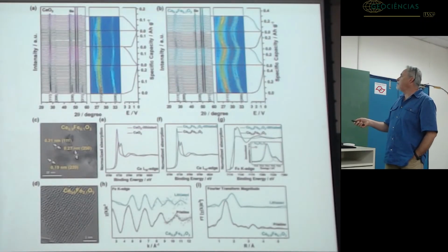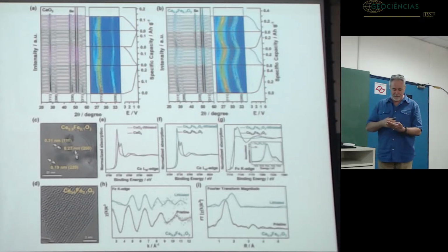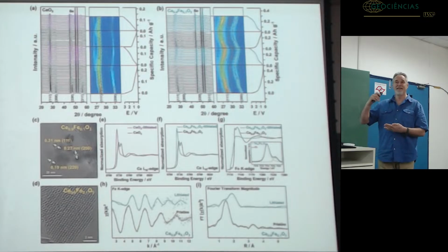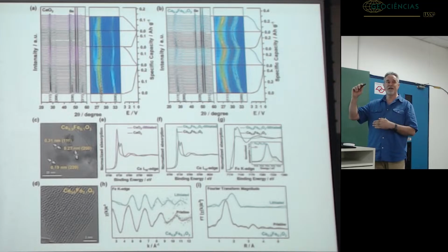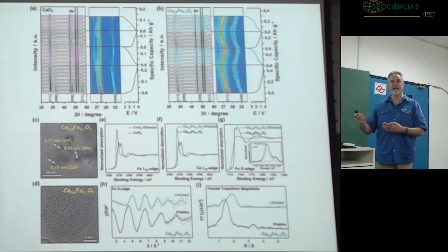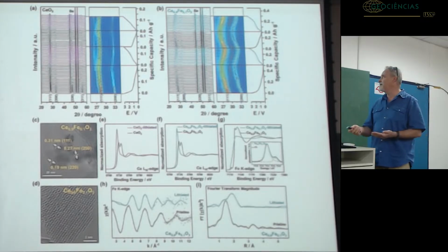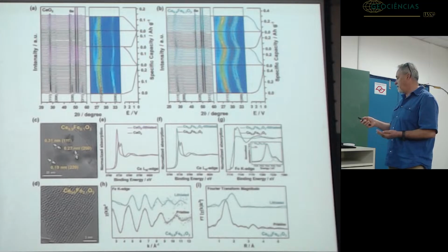And the other surprise was that, checking the numbers, it looks to me that the amount of lithium it accepts is almost double the theoretical one. And we already said that usually the real capacity is a fraction of the theoretical capacity, not exceeding 100%. In this case, we get almost 200%. And with more trials, we get up to 250% of the theoretical capacity. What's happening?